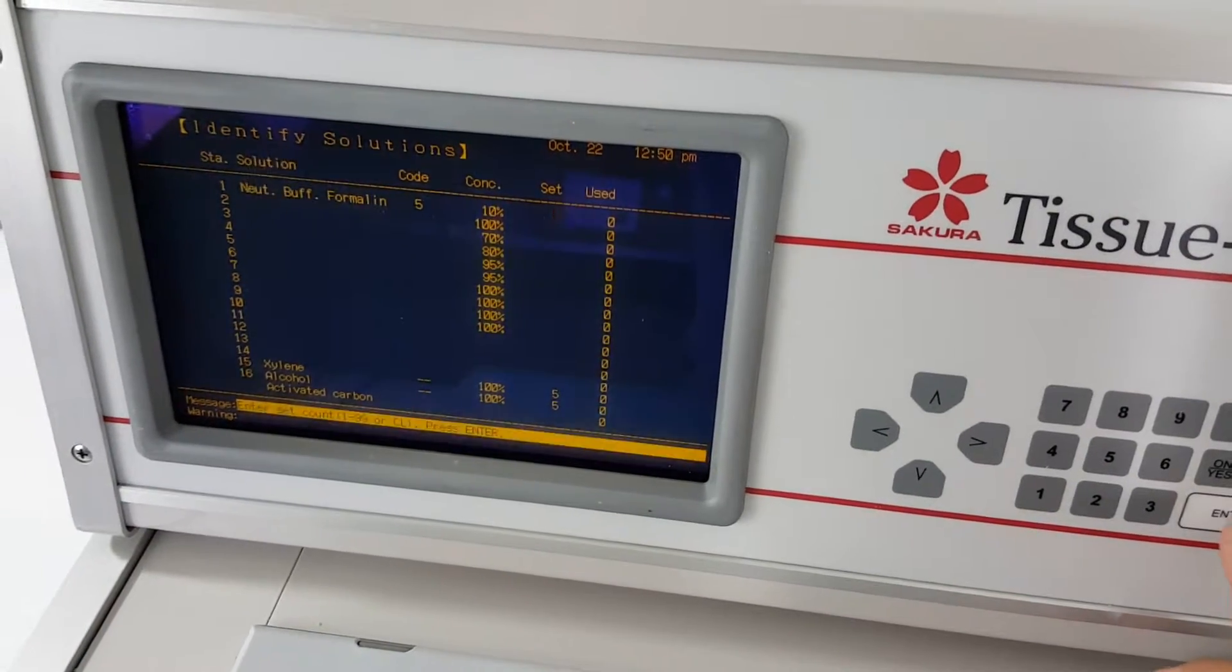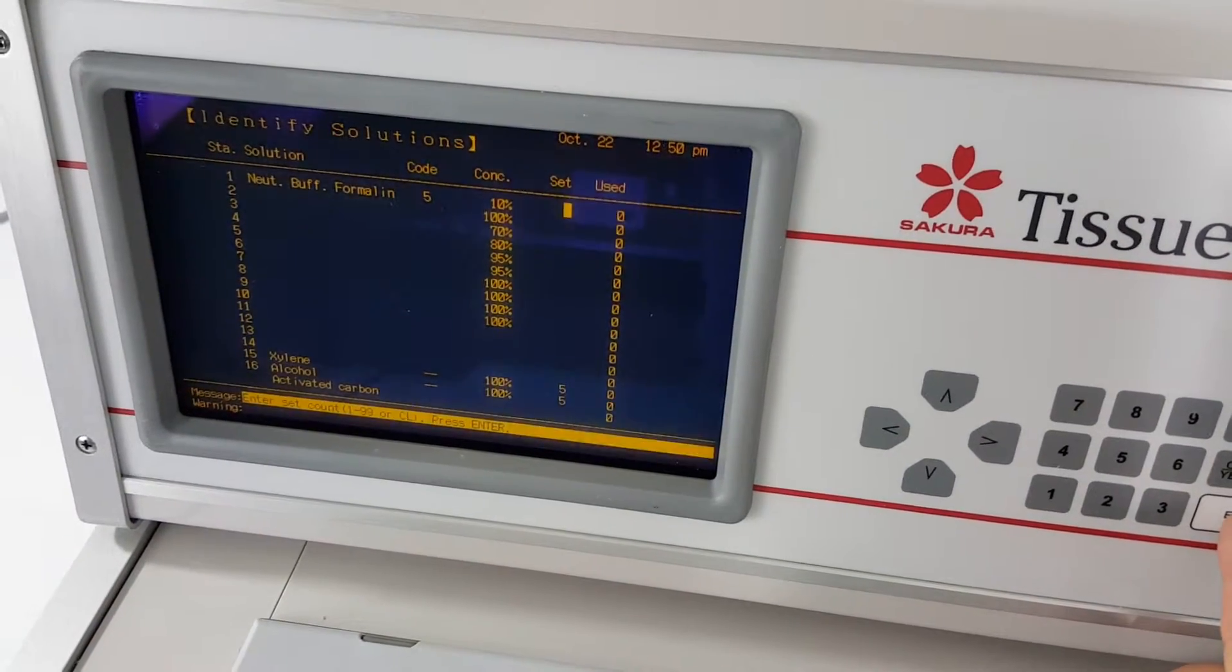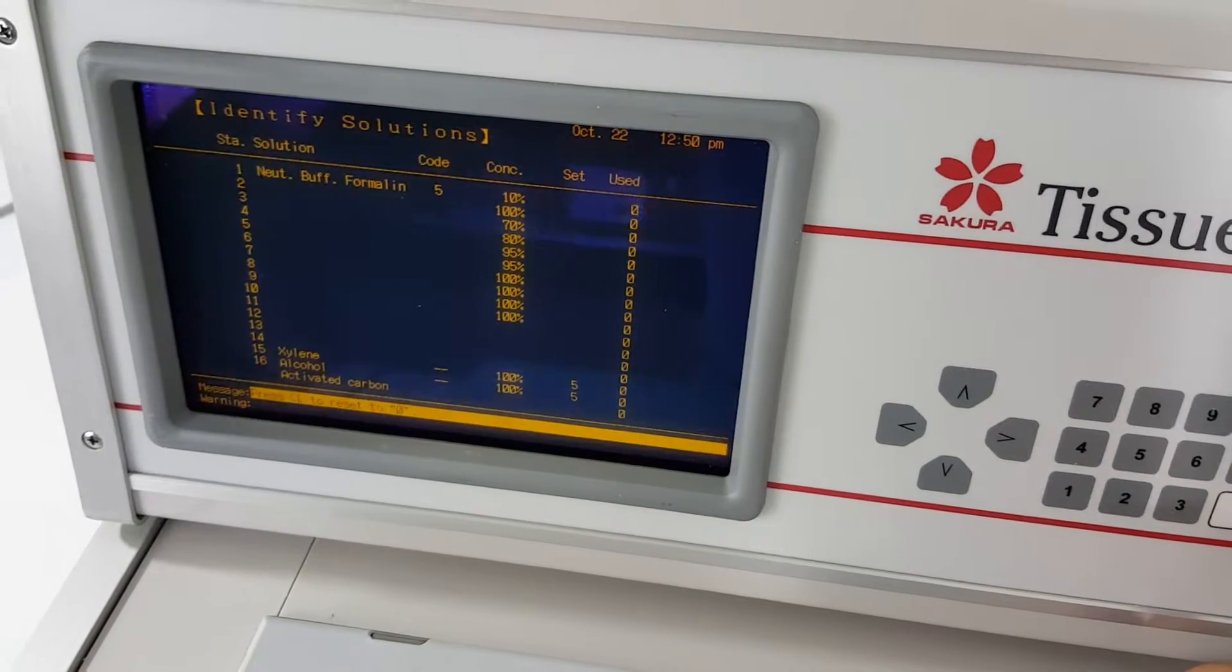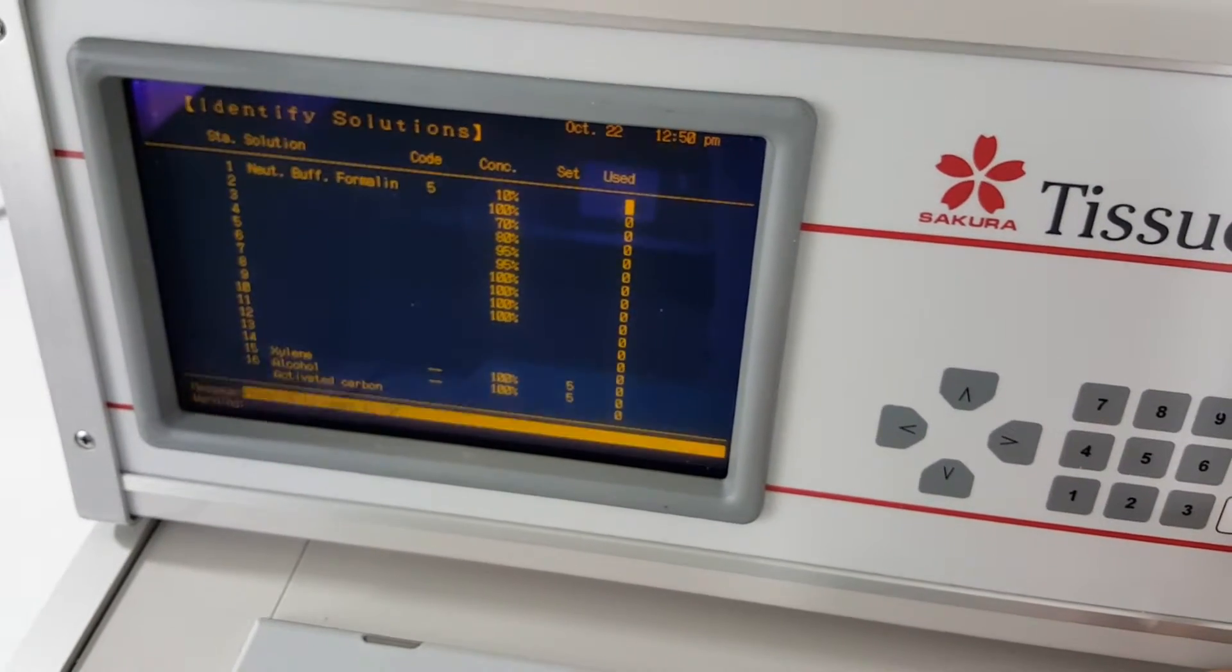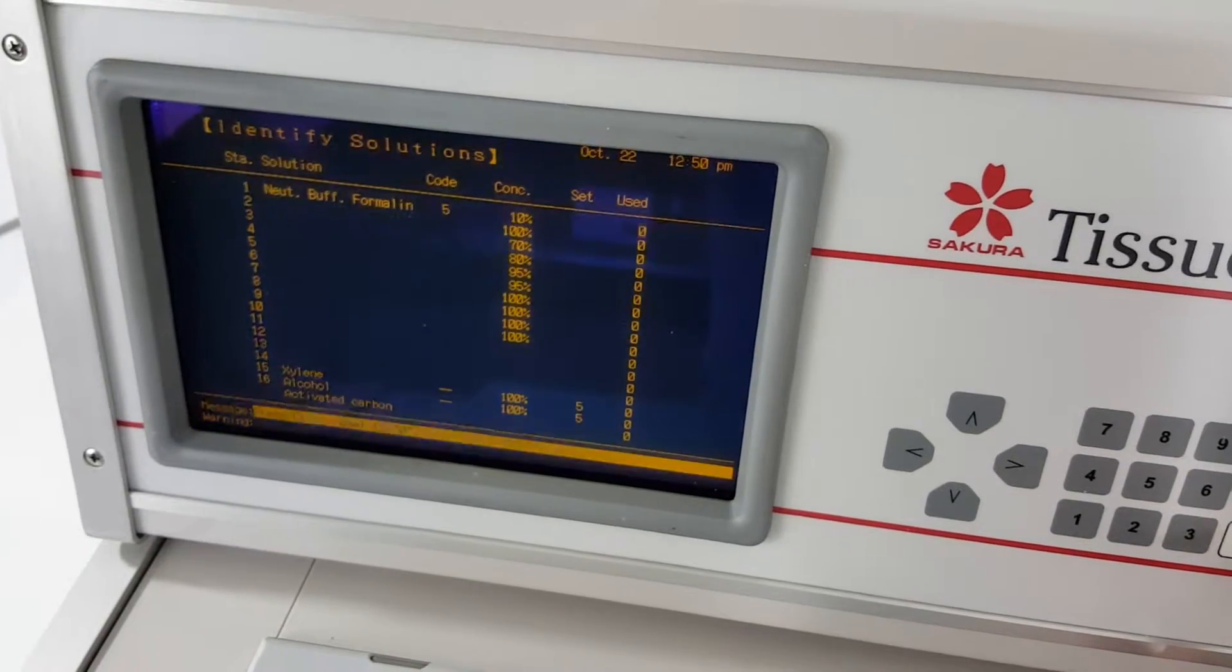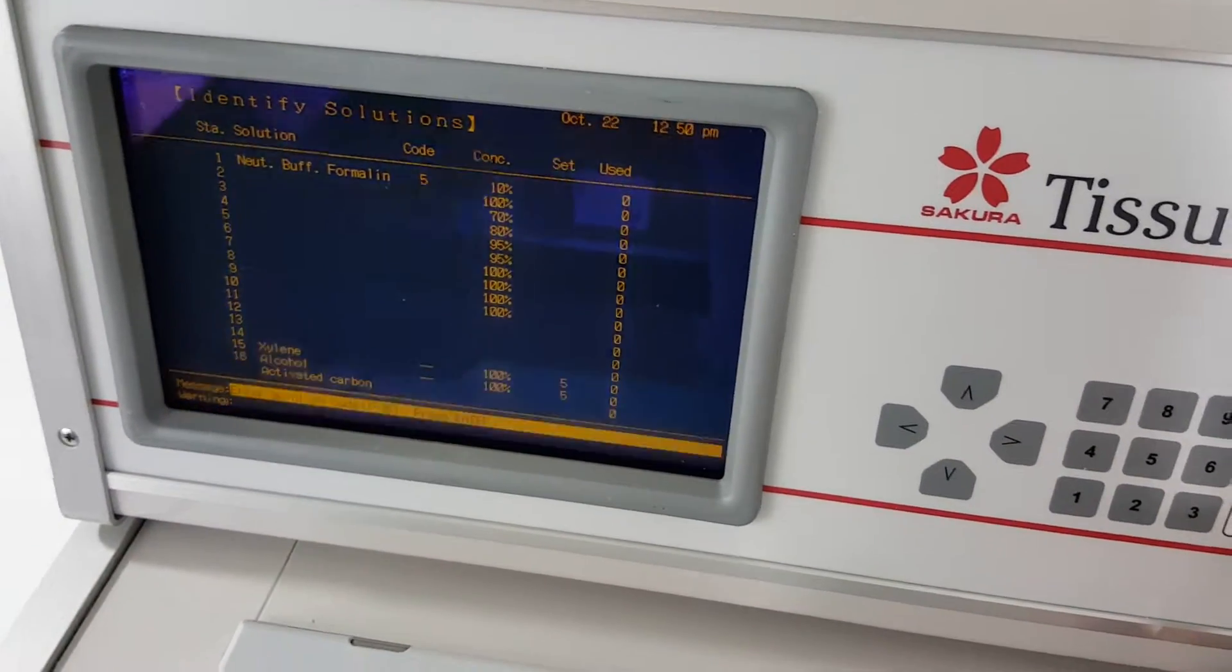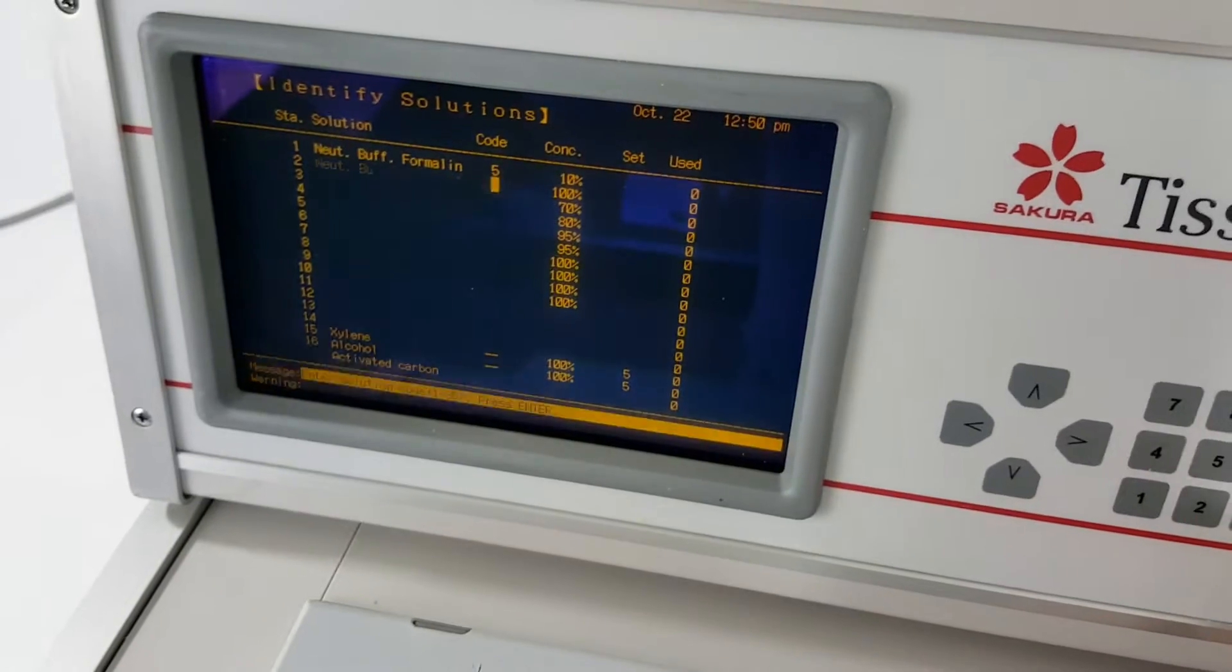So I'm just going to leave that blank. You can do that and it will not remind you. Use that's just going to keep a real-time count of how many times you use that in a cycle. You hit enter again it goes down to the second and I'm just going to quickly do this.